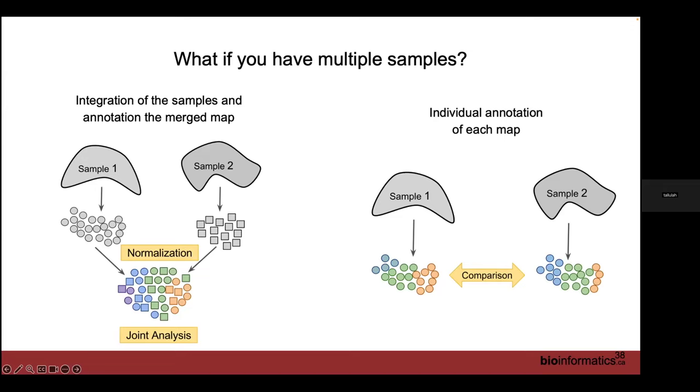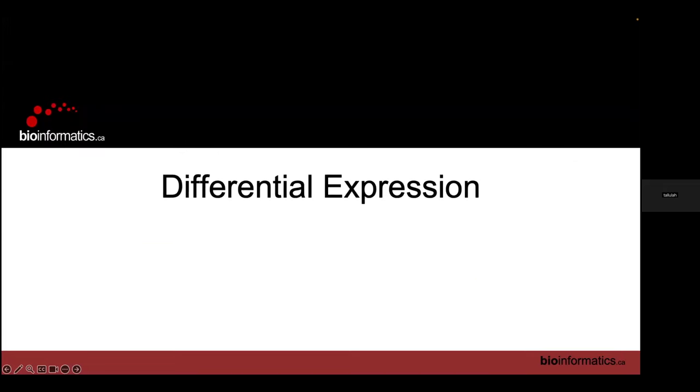Right. Any other questions about annotation? Nope. Okay, so we'll move on to differential expression.